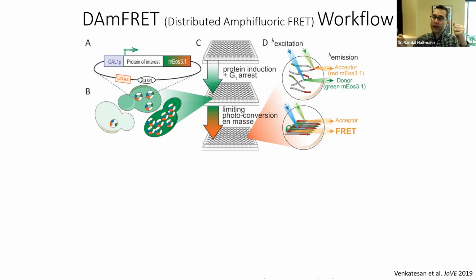And then you have both a FRET donor and a FRET acceptor expressed by the same genetic construct, by a single gene, right? And that's really nice. So because of that, we can then use a system that, in this case, is a noisy high copy number plasmid, such that we explore roughly 100 to 1,000-fold range of concentration between cells. But you can also just do this by transfection into like HEK293 cells.